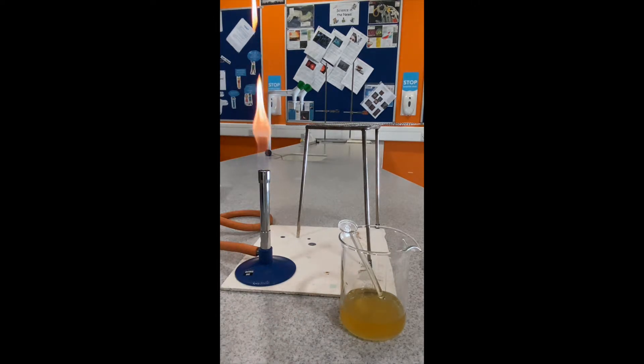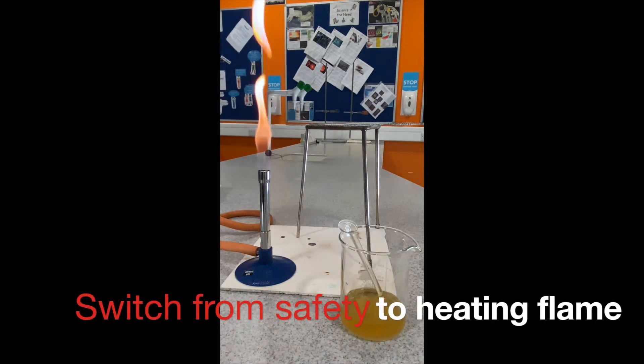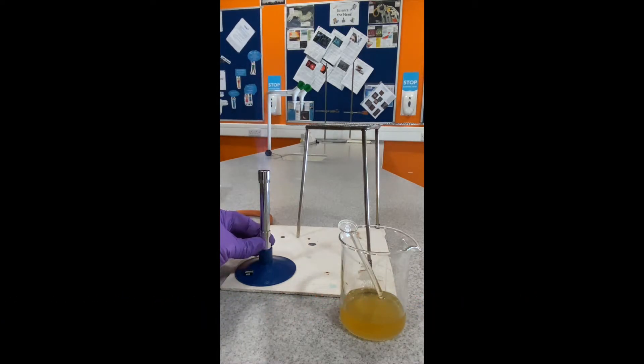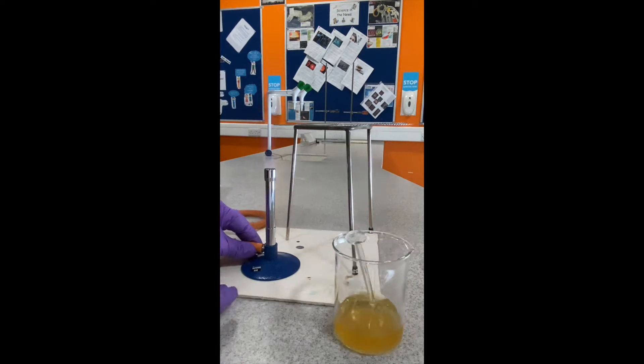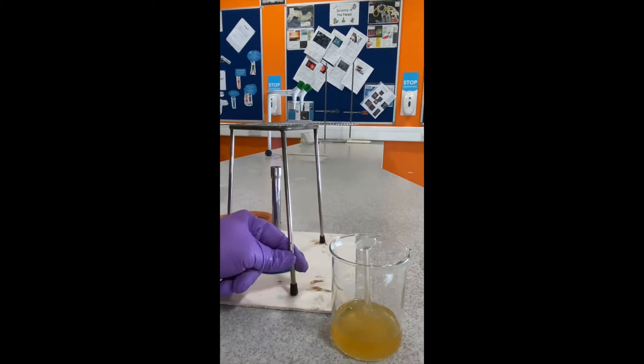Always light the Bunsen burner in clear view. Before moving the Bunsen burner underneath the tripod to heat the liquid, open the collar of the Bunsen burner to produce the blue heating flame.